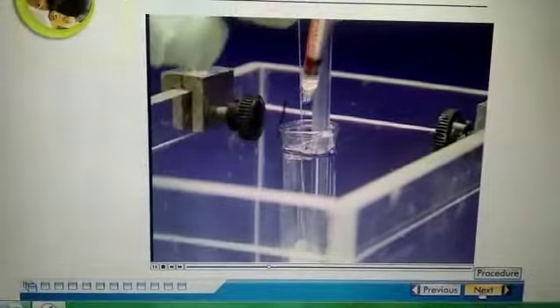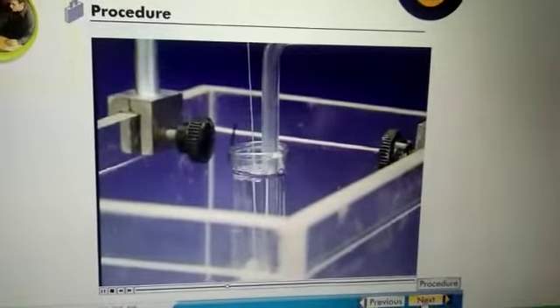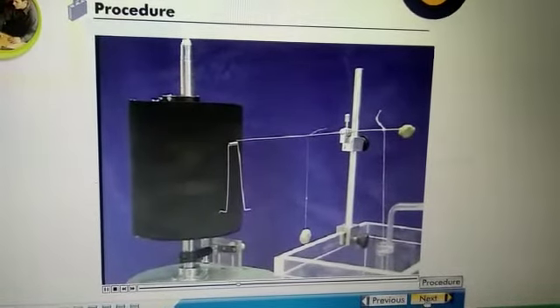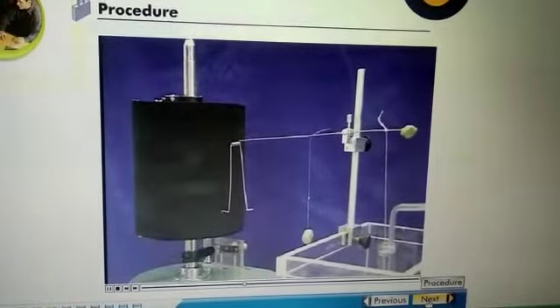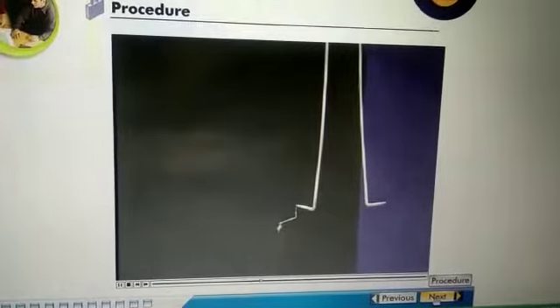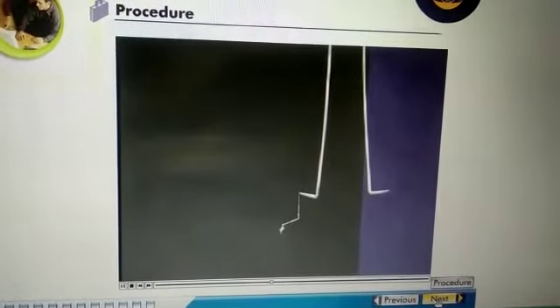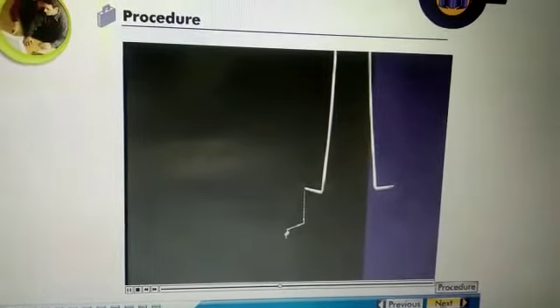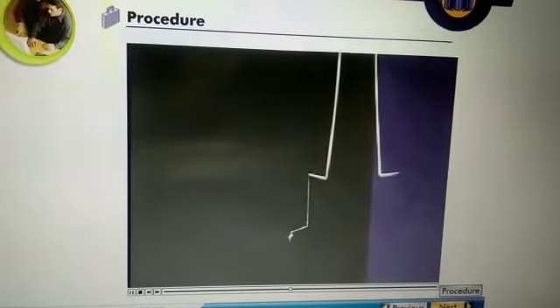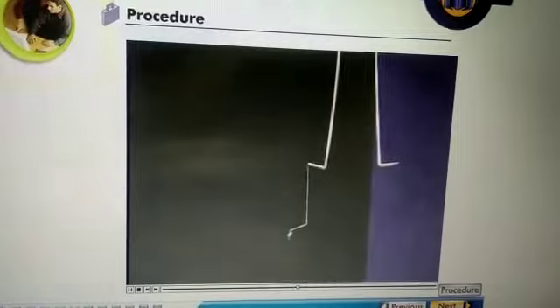Now stop the drum and inject 0.1 ml of acetylcholine solution in the reservoir containing mounted muscle preparation. Start the drum immediately. Record the contractions for 90 seconds. You can see upward movement of writing tip of frontal writing lever on smoked paper.